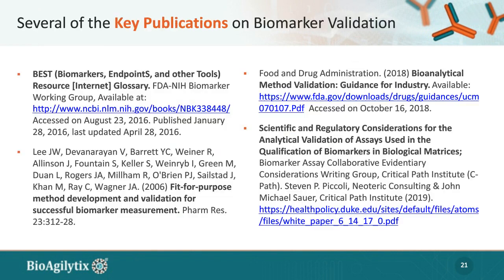There are hundreds of biomarker papers that are published out there. With that being said, I believe there are 4 key biomarker references that, if anybody is writing their SOP or is a newcomer in the biomarker field, I would highly encourage you to read and try to fully understand. I already mentioned BEST to you. That again is where you find the FDA NIH biomarker working group that put that together in 2016. I highly recommend for your definitions, use that as your primary reference point.